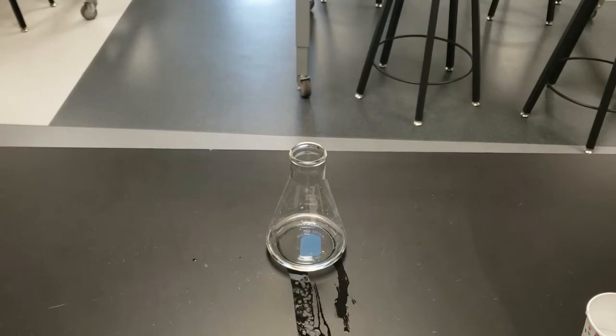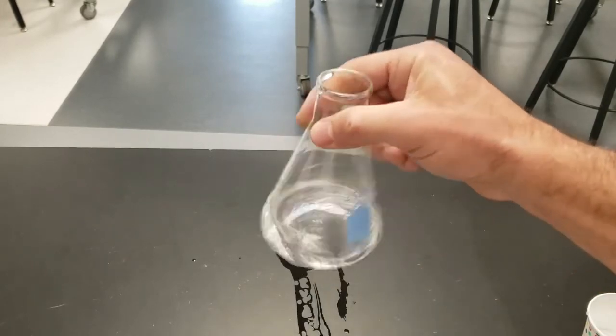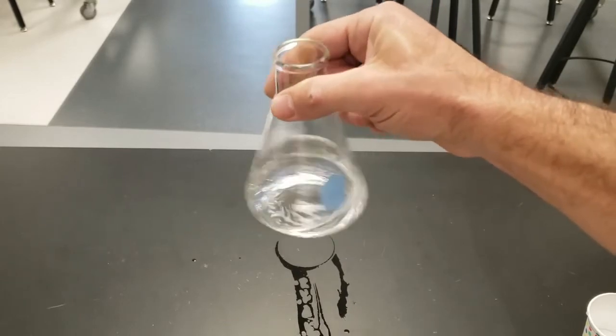And now I'm gonna take a scoop of my unknown and I'm going to put that scoop in my Erlenmeyer flask. So here goes my scoop of unknown. And I am going to swirl this vigorously in a circular motion to dissolve the salt.